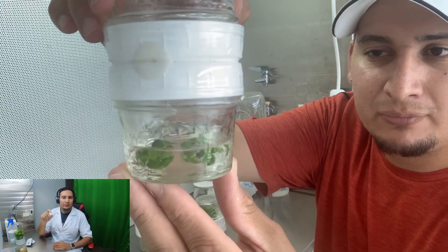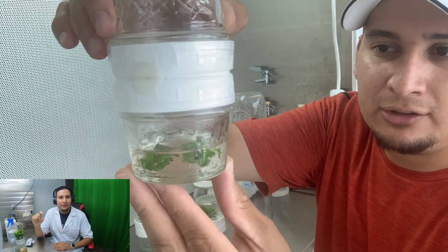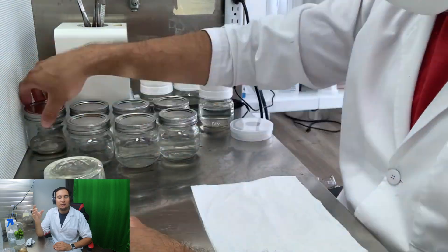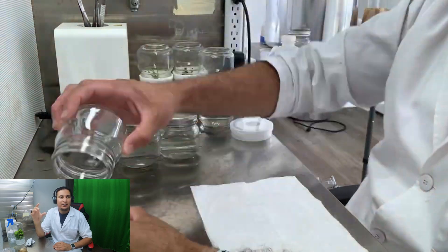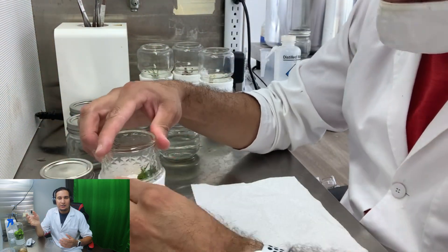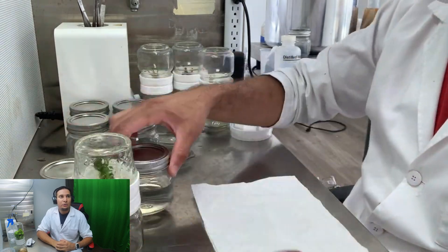I moved the plants from very small 4-ounce jelly jars into slightly bigger 8-ounce mason jars. After that I changed the media and they were starting to grow a lot more.